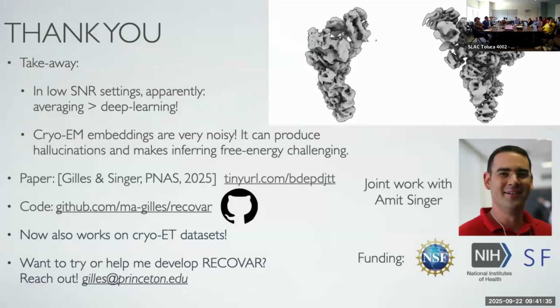I guess I'm curious where the limitation is on these methods. Have you quantified, or do you have comments on, the performance of these methods as you go from lower quality to higher quality data sets, or data sets with a lower versus higher number of particle images?